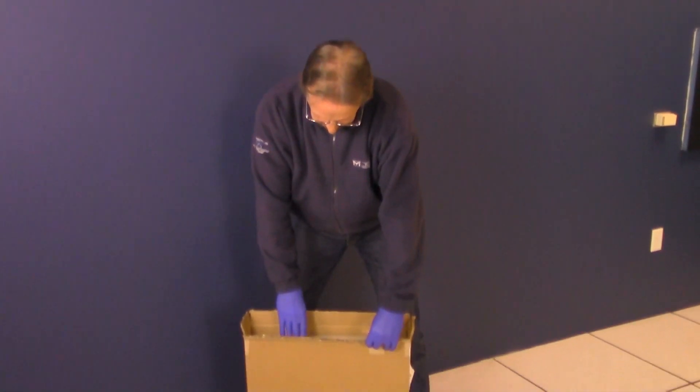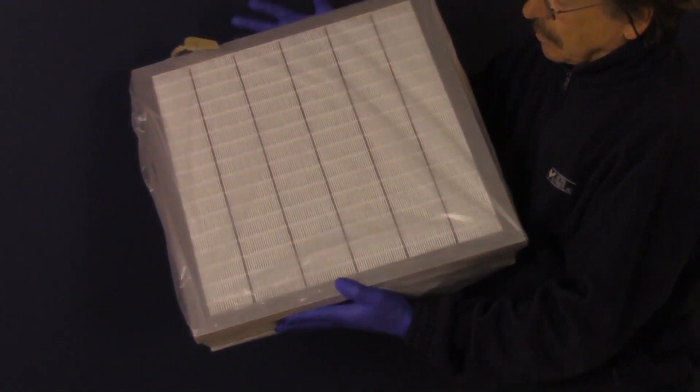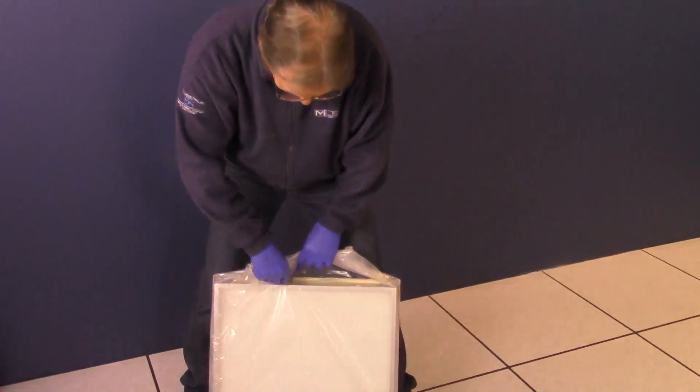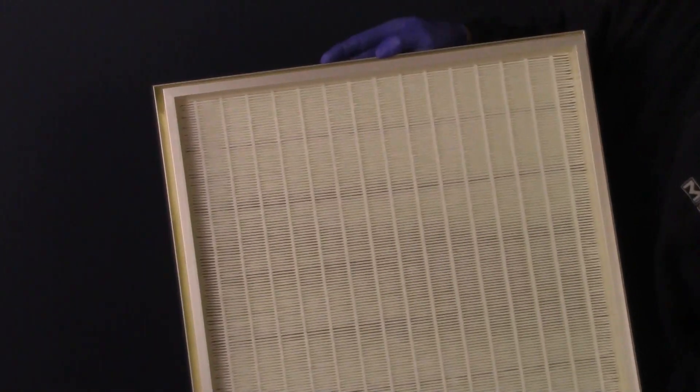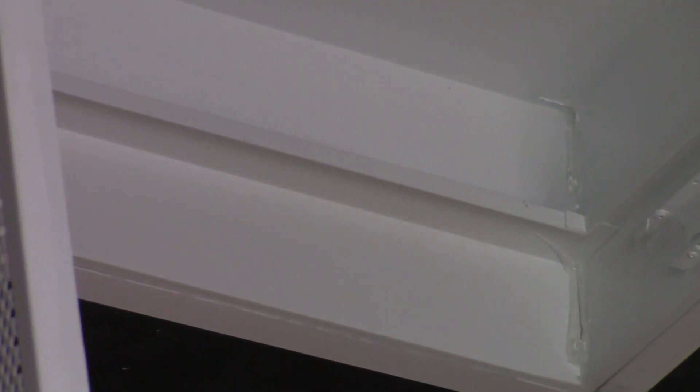Step 3. With gloves on, remove the HEPA filter from the box, visually inspecting it for any damage. Carefully remove the plastic wrap and only handle the filter from the metal frame. Do not touch the filter media as this can damage the HEPA filter and render it unusable. There is a knife edge designed into the HPL-GS unit. This knife edge corresponds to the gel seal track on the HEPA filter.